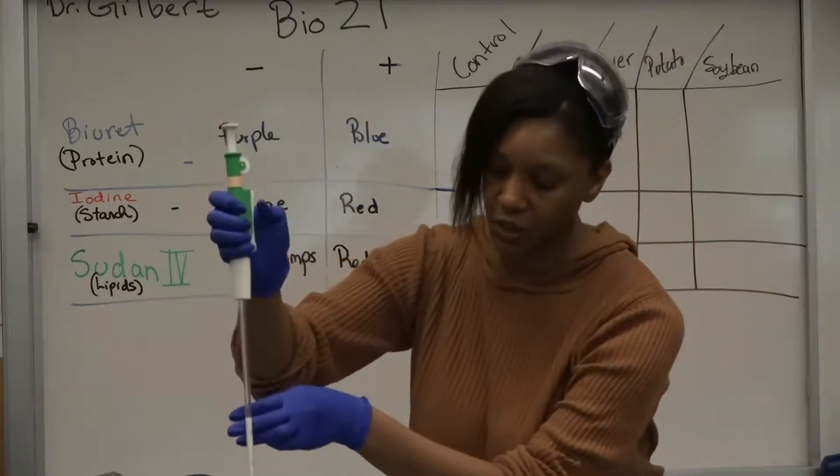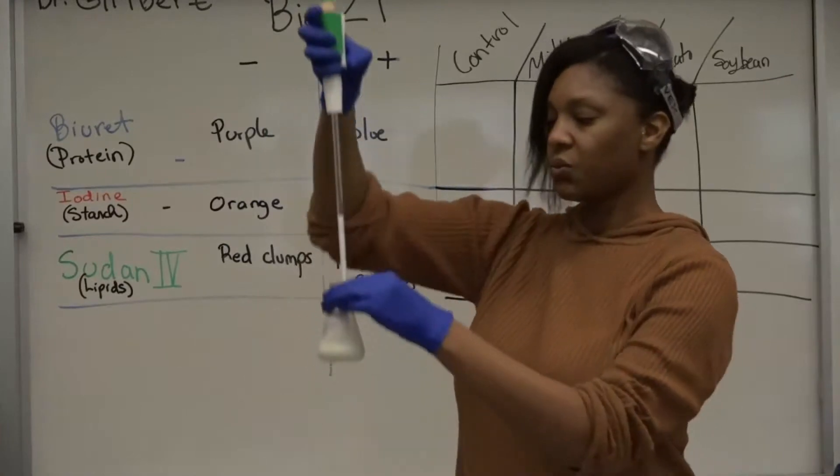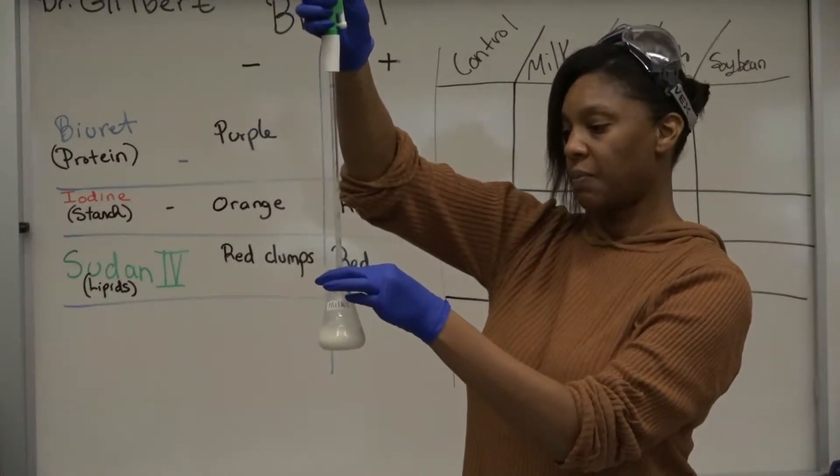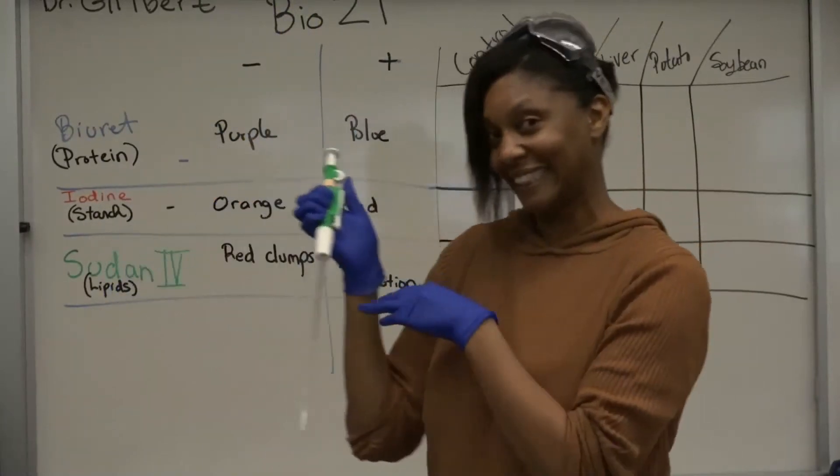Okay. And this is what I'm going to actually put in all the test tubes. To release the liquid, like I said, press this little plunger. Back into our beaker. And cut.